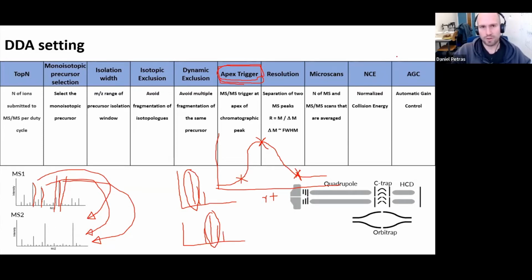And the automated gain control is actually a really neat setting that measures the number of ions that are submitted to an Orbitrap readout. And what that aims to is basically to reduce space charge effects. So you may remember that little window experiment I stole from The Simpsons, where all the ions try to pass through that little window and then they get stuck. And you have similar effects inside of an Orbitrap when you get too much ion density. So then you can actually see an effect that the different ions expel each other, and what that typically leads to is peak broadening.